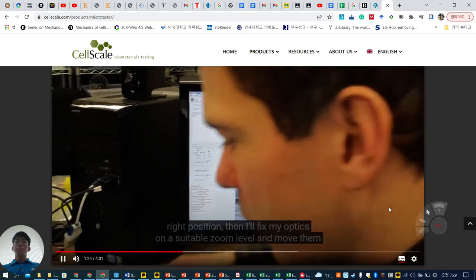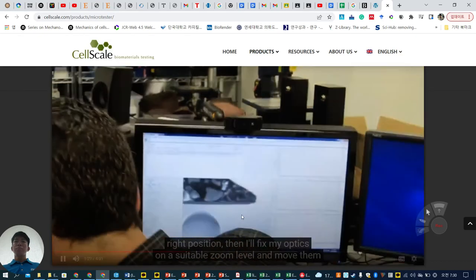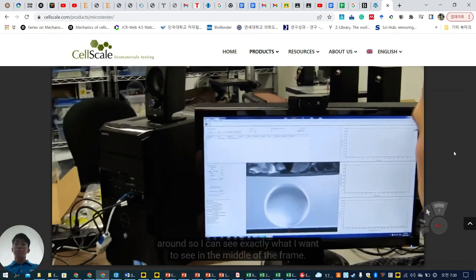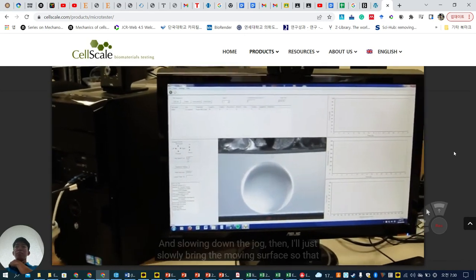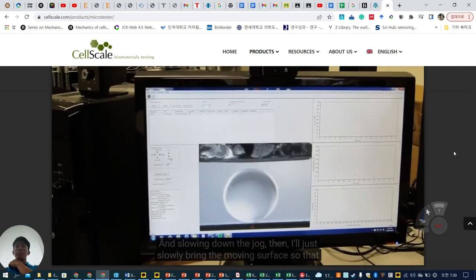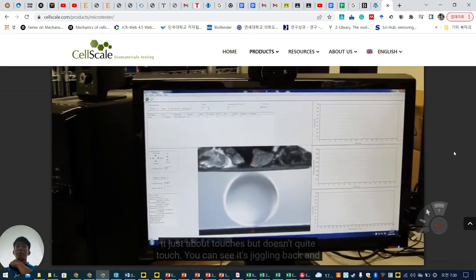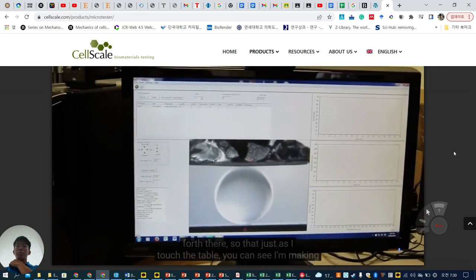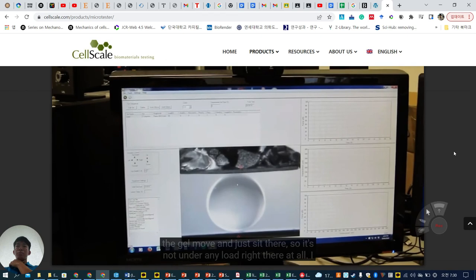Then I'll fix my optics on a suitable zoom level. Zoom. And move them around so I can see exactly what I want to see in the middle of the frame. And slowing down the jog, then I'll just slowly bring the moving surface so that it just about touches but doesn't quite touch. You can see it's jiggling back and forth there. As I touch the table, you can see I'm making the gel move and just sit there. So it's not under any load right there at all.